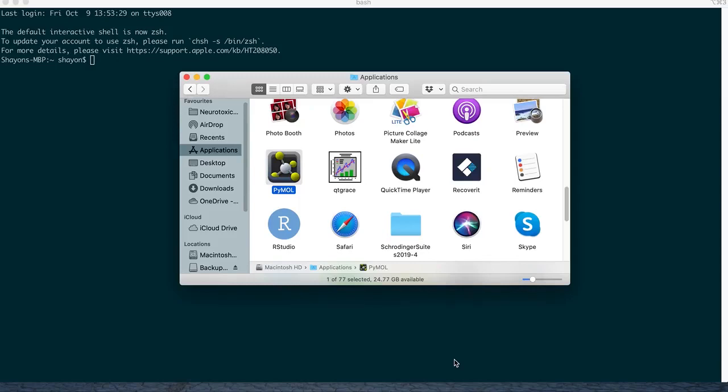Okay guys, this is going to be a short tutorial and mostly a follow-up on whatever we did until now on VMD and Chimera.